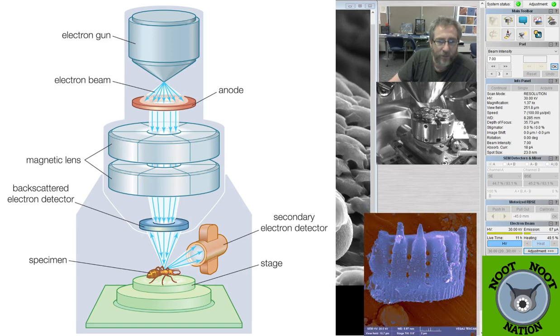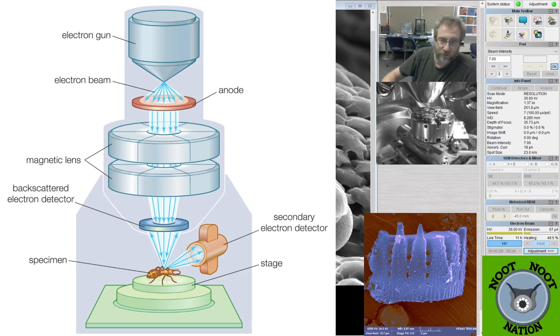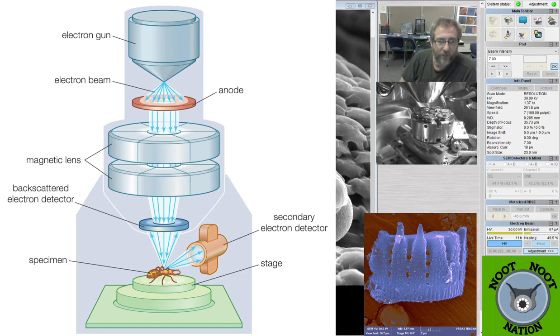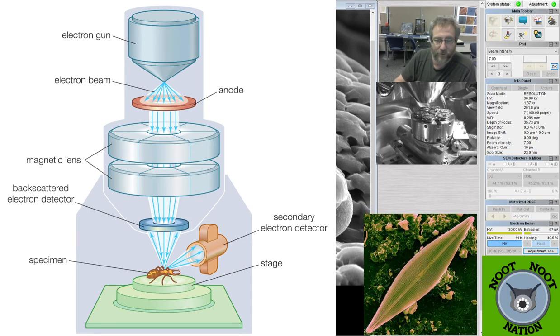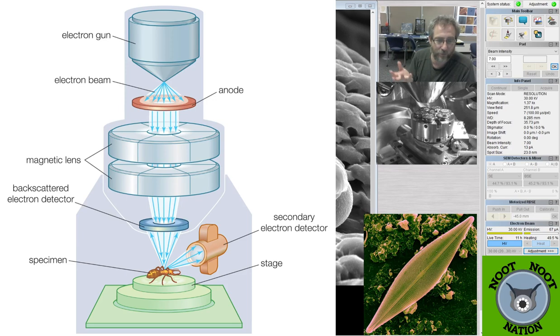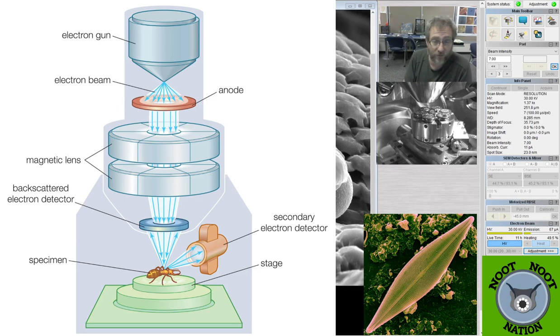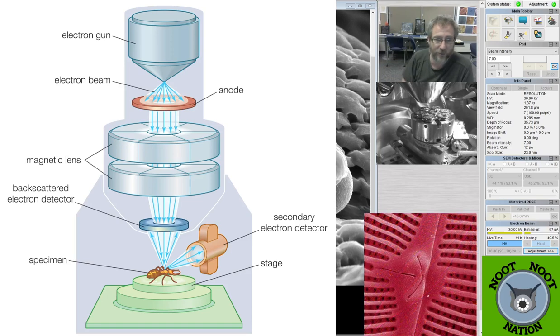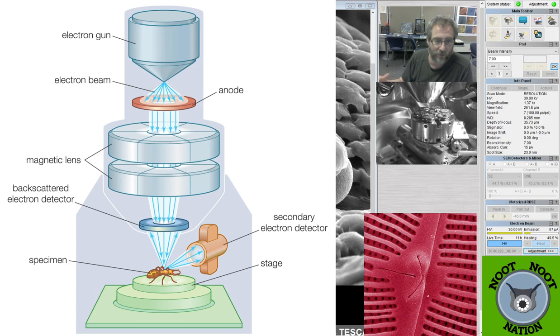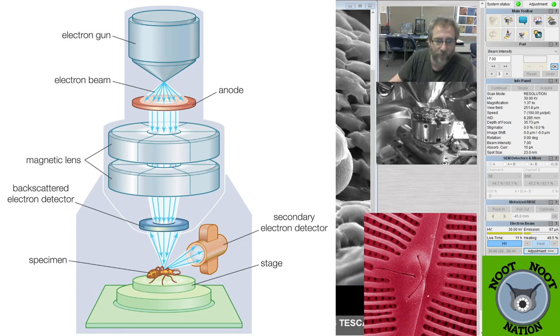And then it does that as it moves across the sample and then rows or lines and scans and feeds back each bit of information. So if there's a lot of electrons that come back from a particular site, it ends up being a bright pixel. And if there's not very much, it ends up being a dark pixel. There's no color because it's only giving us information from electrons. So we don't see any kind of color. We just see bright and dark areas. But it functions a lot like a flashlight in that sense.